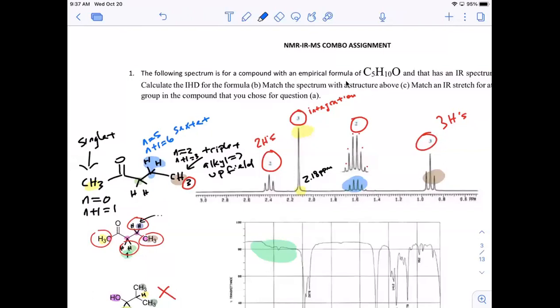So you see again, these 4 things are always going to dominate how we interpret a spectrum. Where the protons show up, how many protons each signal integrates for, how many signals are present. All those things are going to dictate how we interpret this spectrum. And then how many lines each signal is split into. So those are my 4 interpretive properties or principles for interpreting NMR.